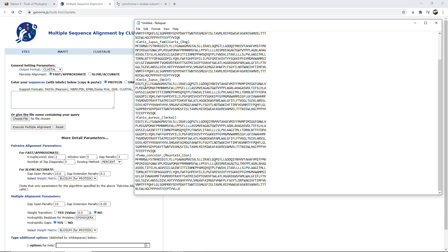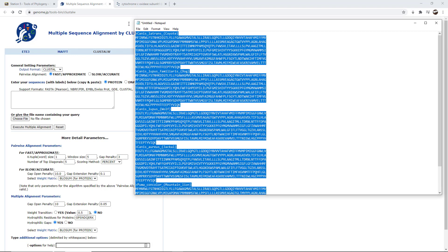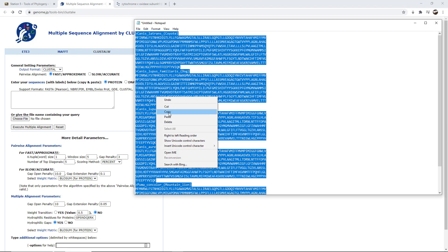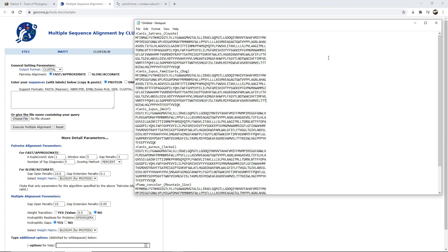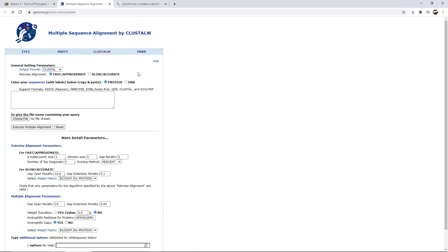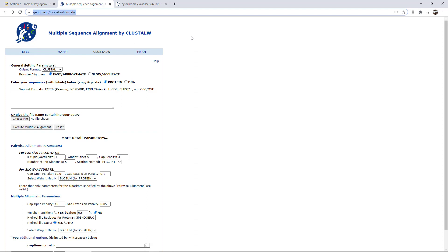Okay. Well, the next thing we're going to do is I'm going to go ahead and copy this. I'm going to highlight it and hit control C, or you can right click on it and hit copy. And then I'm going to go to ClustalW. Now in your lab materials, I've given you this link genome.jp/tools-bin/clustalw and you can click on that link to come here. This is an online tool. You can do everything here online. Now there's some limitations, but for our purposes, the limitations are not important.